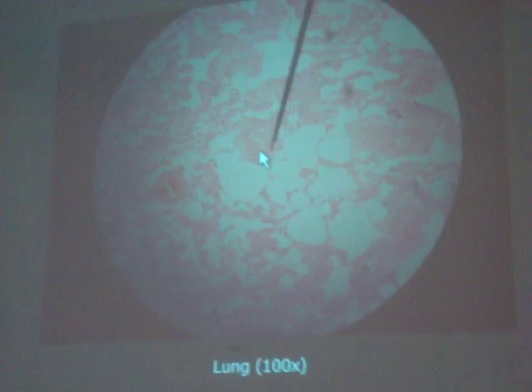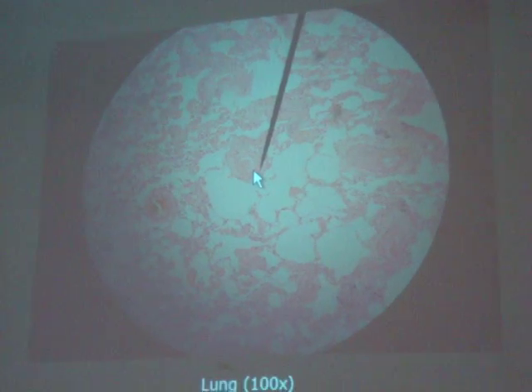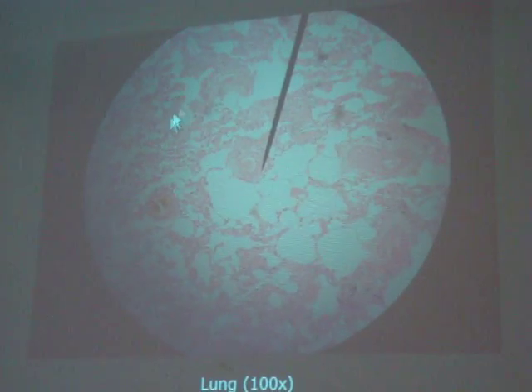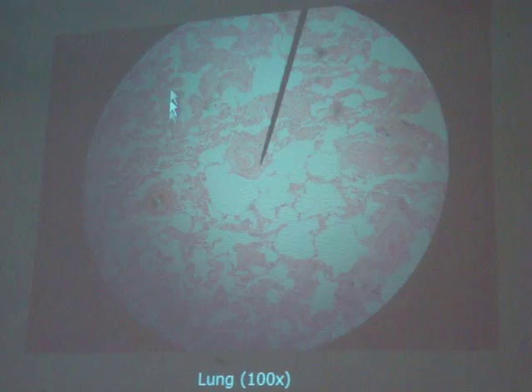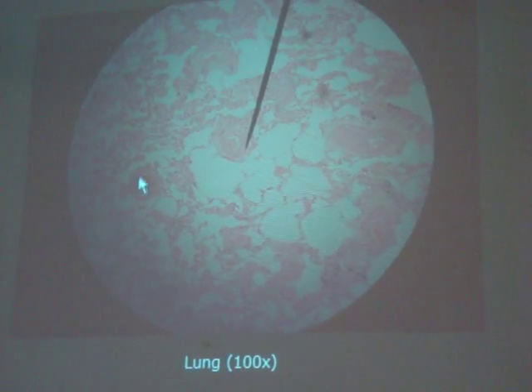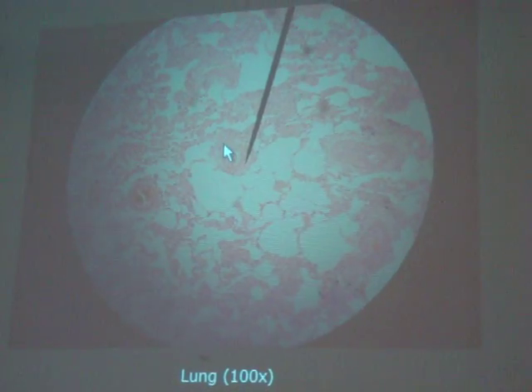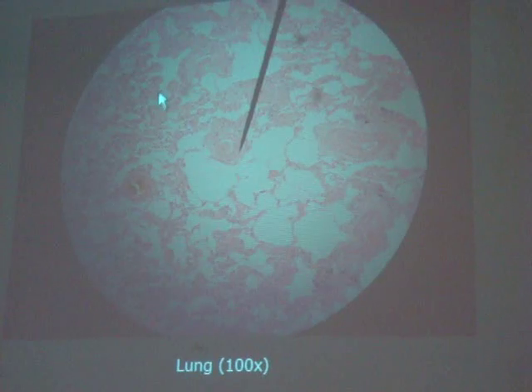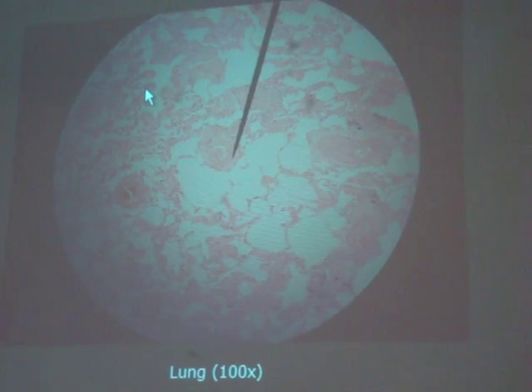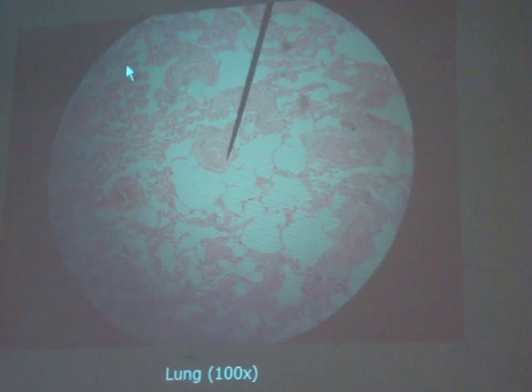And then if you remember, the alveoli are kind of like grapes on a stalk, and so that's the way you can remember what those are. And so basically that's going to be kind of the stuff in between. So if we were to label this, that'd be a bronchiole, this thing right here on the mouse, or this. Okay, I see those? And then like this would be alveoli. Alveoli is plural, alveolus is singular. So here's some.